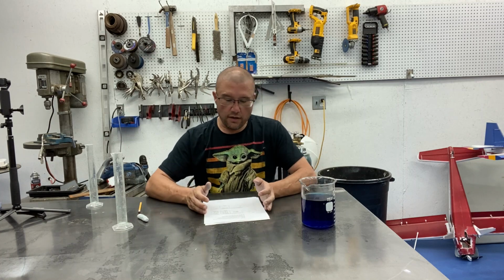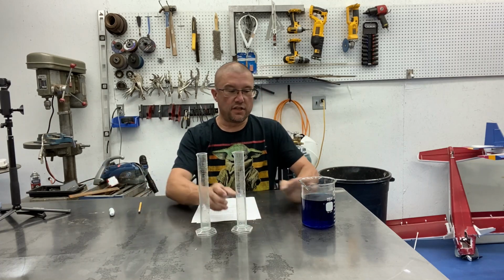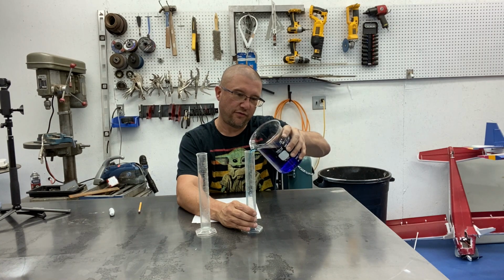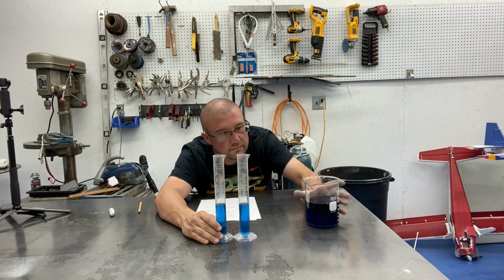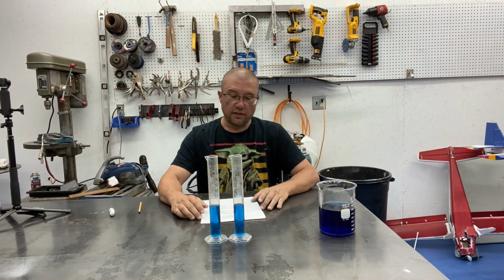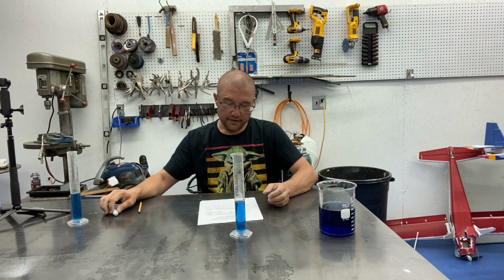Now that we've done all the steps for test 1 and recorded everything on our data table, let's move on to test 2. Test 2 starts out, fill the graduated cylinder and record the volume as you did before. So we're going to go ahead and fill these both up again, just so it makes it a little quicker. And we're going to stick with 50 milliliters because it's easier for us to do our math that way. So I filled our graduated cylinders. We have exactly 50 milliliters in each one. We're only going to be doing one at a time, so I'll set this one aside.